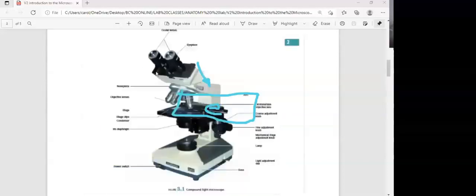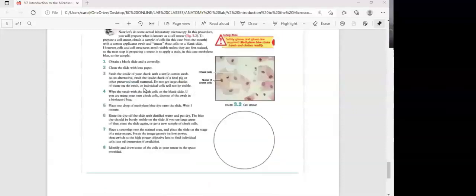Let me see. We have focusing of the microscopes, and you're going to get some slides. And there you're going to have a letter E. This is basically for students to begin to practice with a microscope. After students practice with the letter E, they get a slide. This is one cell right here. This is another cell. You have another one right here.